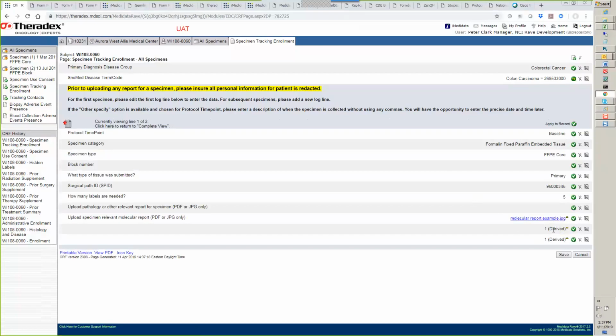And we found that if we hid them from the end user, then the custom functions didn't work. So we had to include them on the screen. And even though perhaps it's a little confusing, there's no labels for these fields, as you may have noticed, Sean, when you were playing around in UAT. Yep. Okay. So leave them alone. Don't worry about them. Yes, that's right.